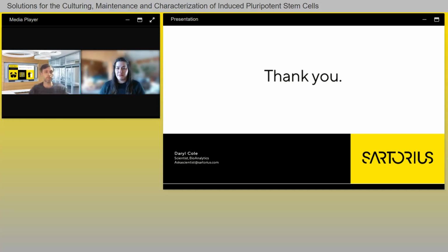Excellent, thank you. Our next question asks, can the Incucyte measure growth of iPSCs over time? Yes, the Incucyte can allow users to measure iPSC confluency over time, as I showed briefly in the webinar, and that allows you to determine changes in growth patterns in different conditions.